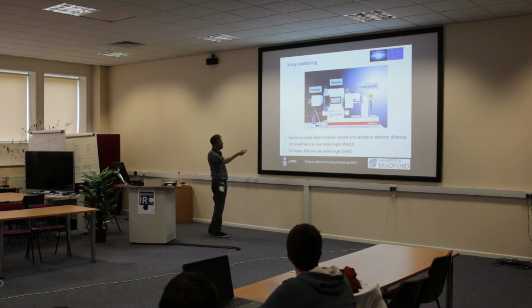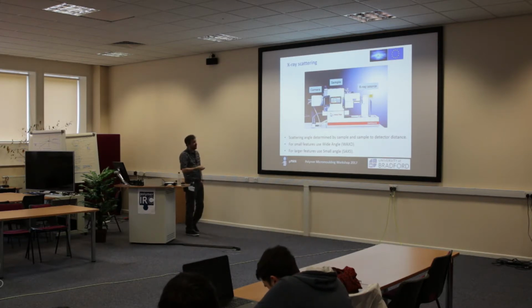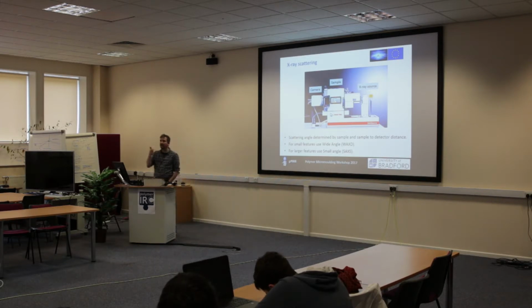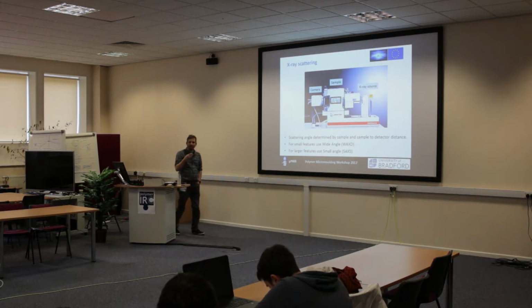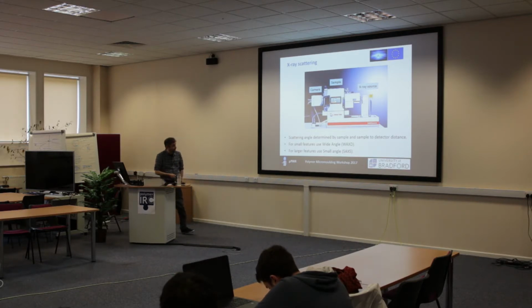You put your sample in an evacuated chamber, and you have a camera on this end. That's pretty much it. Fire it through. X-rays scatter off the crystal, off the faces of the crystals at certain angles, and from that we can infer quite a lot about our material. Similarly, if you have particulates within there, they will scatter off associated with the distance between these particulates. There's a lot of analysis further down the line, but it works kind of well.